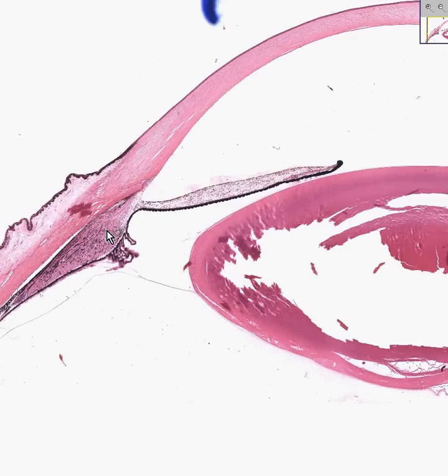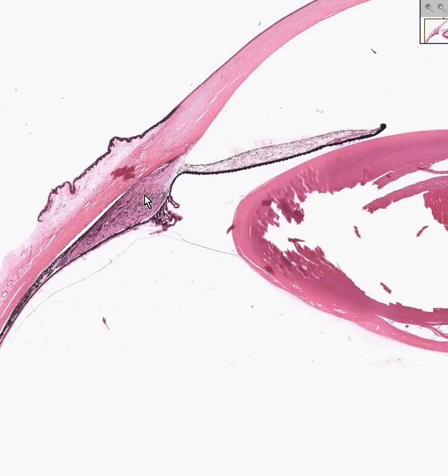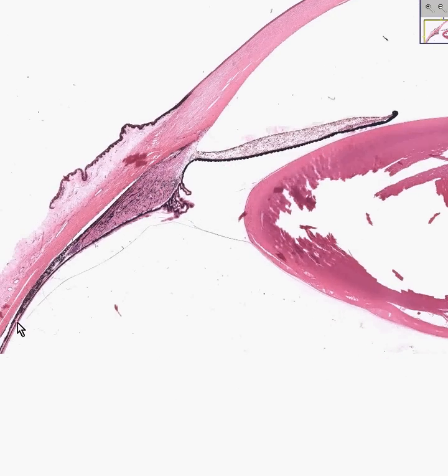It consists of the ciliary body and ciliary processes. And further back into the eye, it consists of this entire pigmented area here called the choroid.